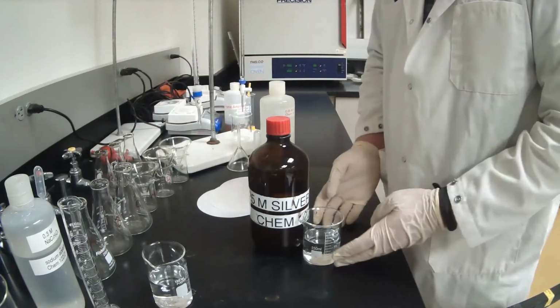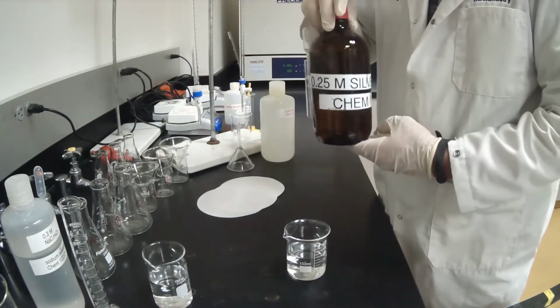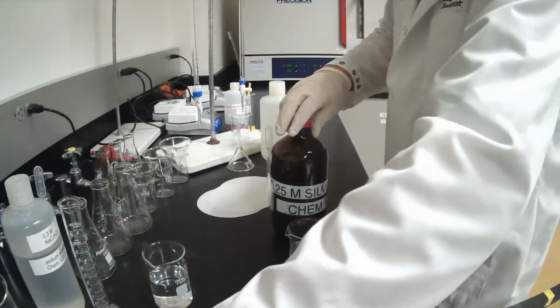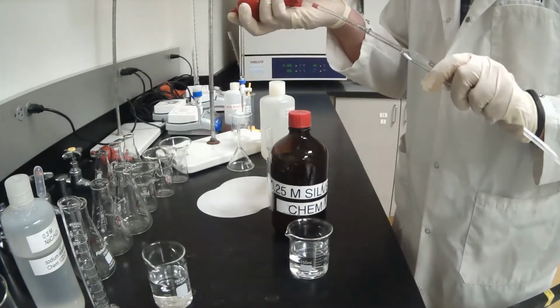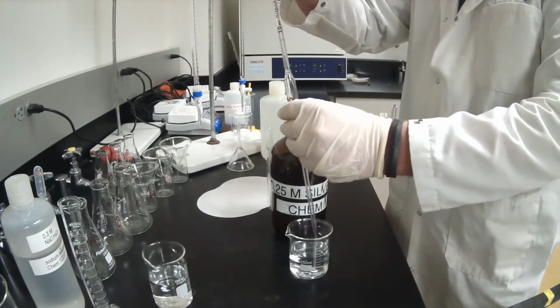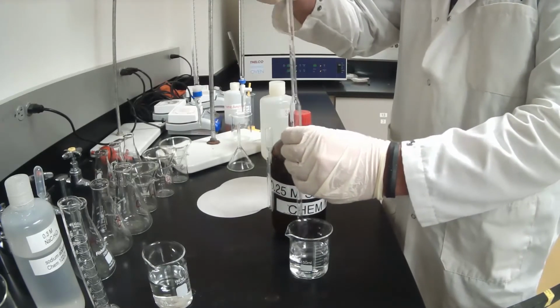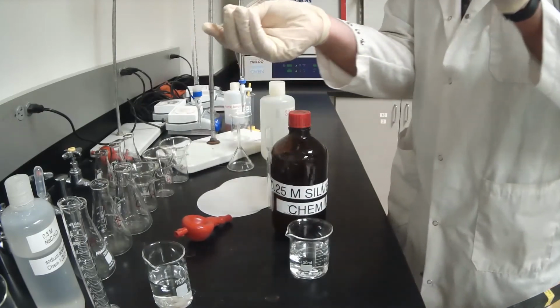In this beaker here in front of me, I've already rinsed this with my silver nitrate solution and then put it in here. I took the liberty of already rinsing one of these pipettes, but I'll show you the other one and why it matters. So you need to make sure you clean everything. Silver nitrate likes to precipitate everything, and since we have halogens in our water, you will see that it will try to precipitate anything that's on the inside.